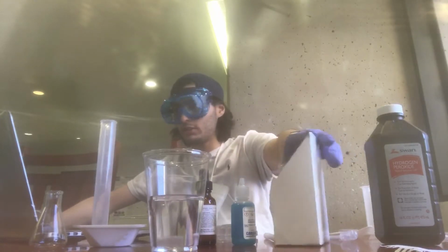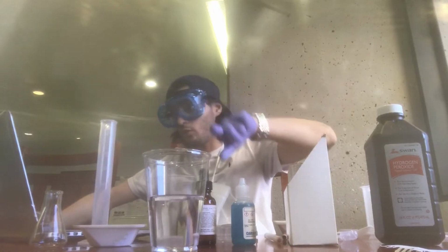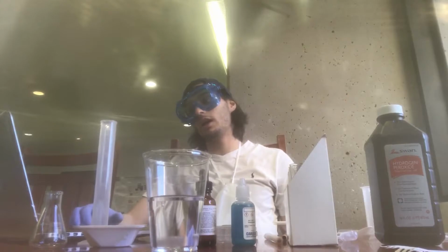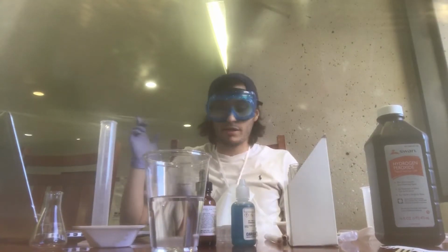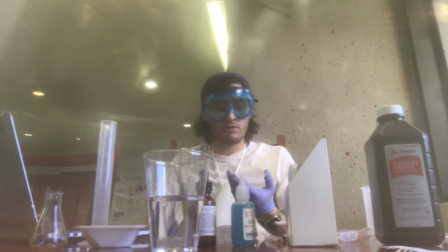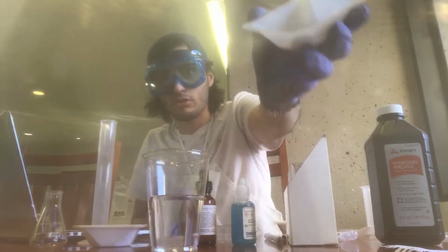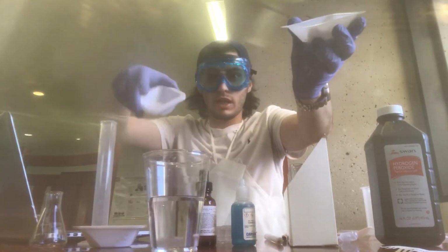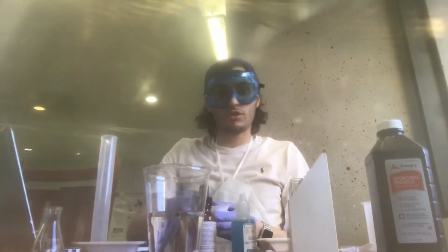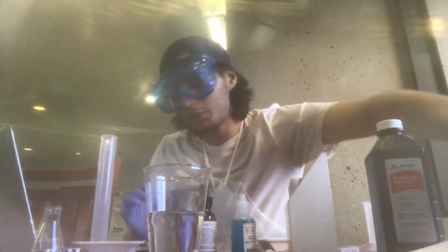Test tube racks with the test tubes in them, a 10-ounce plastic cup, and we also have the water. Then we have the 10 ml graduated cylinder, and we also have the ice. I have to go grab that, it's in the freezer. For the sodium chloride, I have it all right here in this little boat. These are the empty ones that we're going to use in the experiment, and this is just somewhere I can put them. And for the white paper, I have it right here. So let's begin.